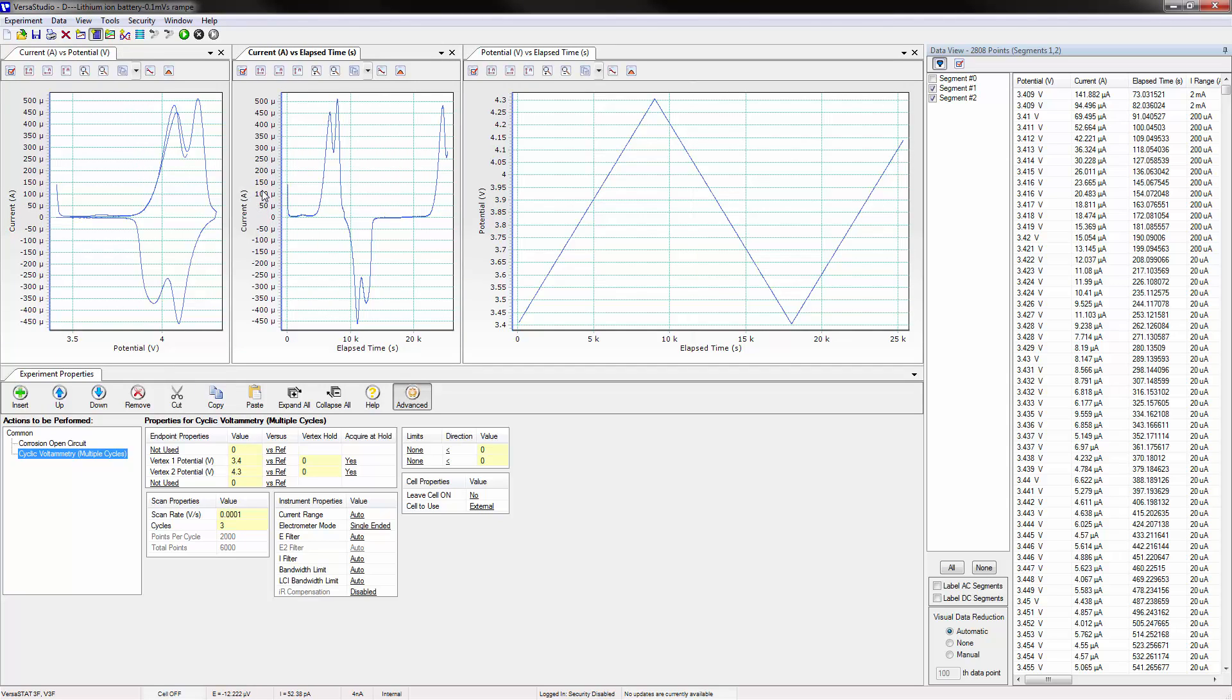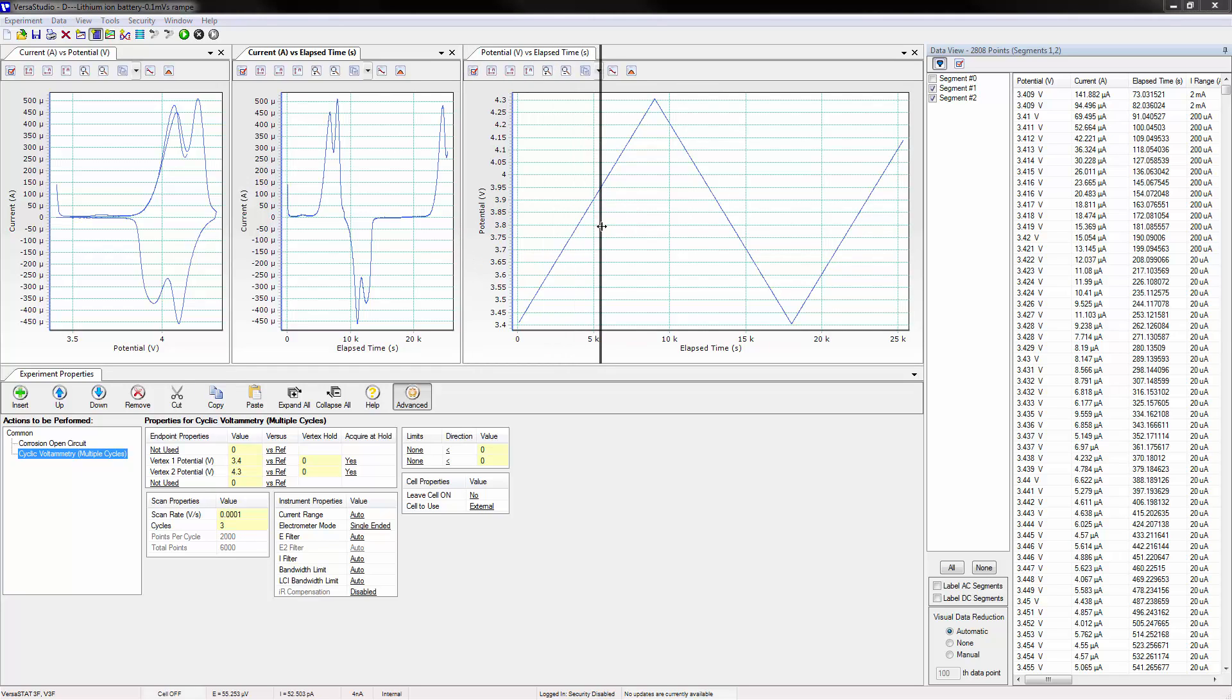With three graphs side by side, the need to resize the various windows becomes apparent. Look for the resize icon, left click, and drag.